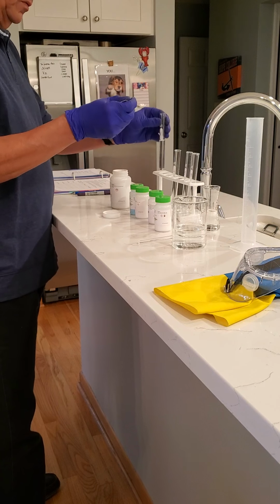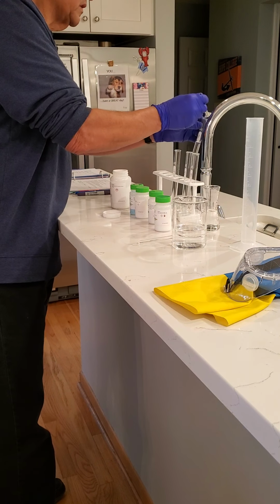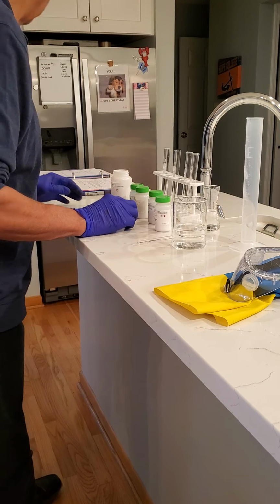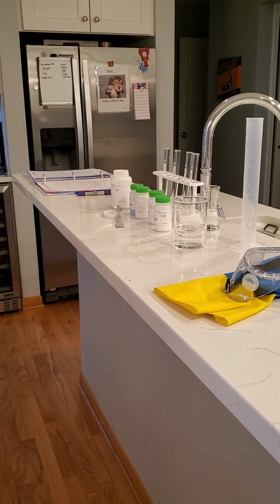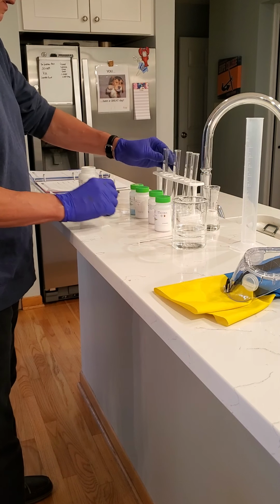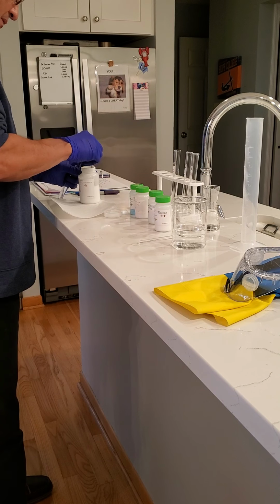You might want to hold this over the sink just in case we spill it. This is very powdery, so let me get something to put underneath in case we spill the powder, not making too much of a mess. Okay, so let's add calcium hydroxide to this now. I'm going to use the flat end instead of the round end, that might be easier.